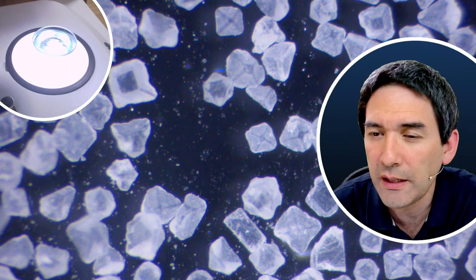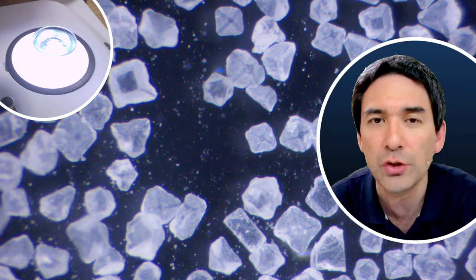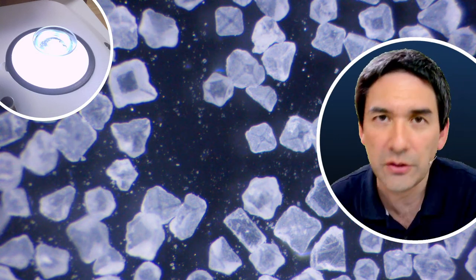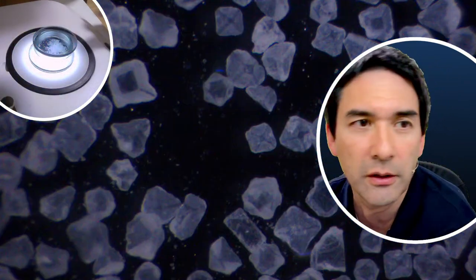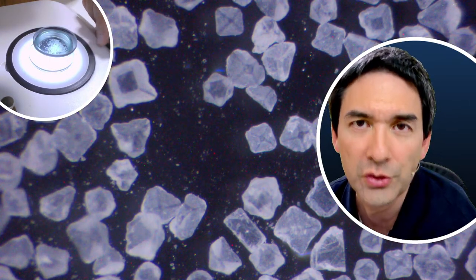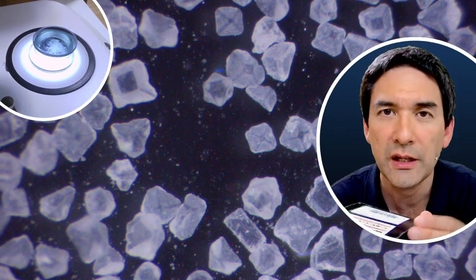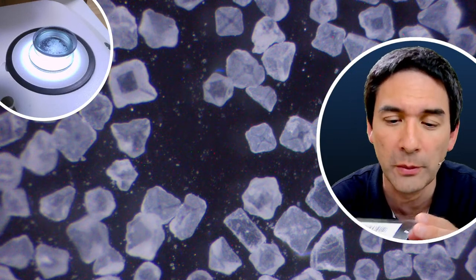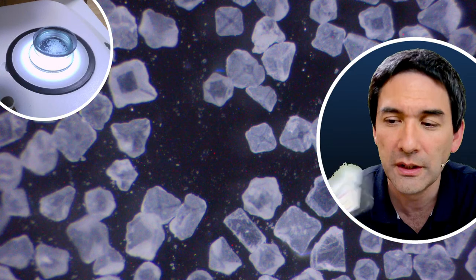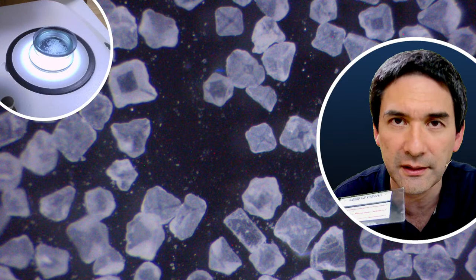There is already a comment from Hadrian. I'm curious where to put the upper polarization filter. What I usually do is the following. If you're over here, it's kind of clear. I just place it over the petri dish that I have. But you can also do the following. If you use a thin filter like this, and if you use the 4x or maximum the 10x microscope objective in your compound microscope, then there is still enough space. So it is possible to place the filter between the objective and the specimen slide.